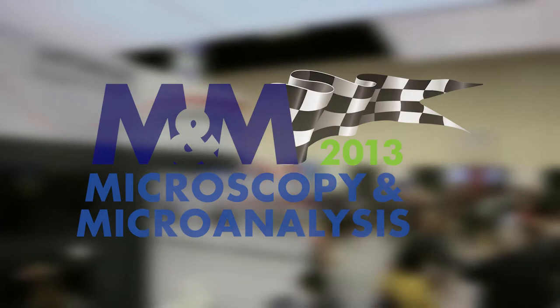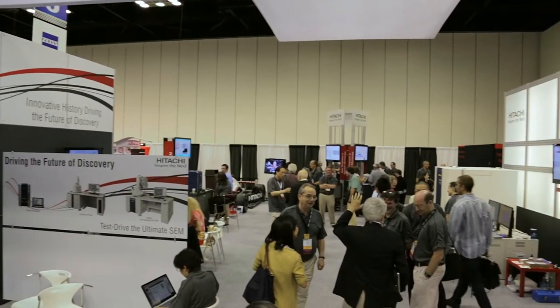The Microscopy and Microanalysis 2013 conference took over Indianapolis this year with speakers, tutorials, workshops, and booths featuring cutting-edge technology.